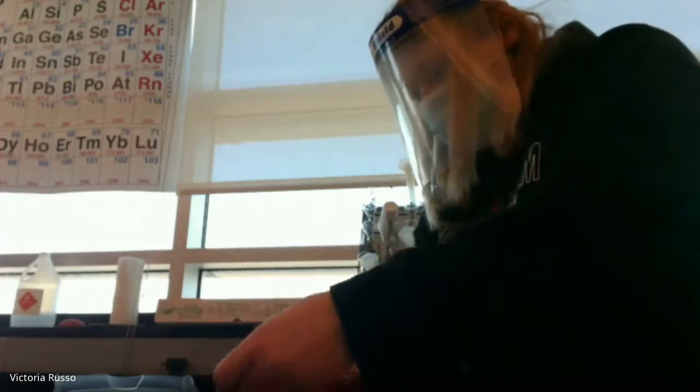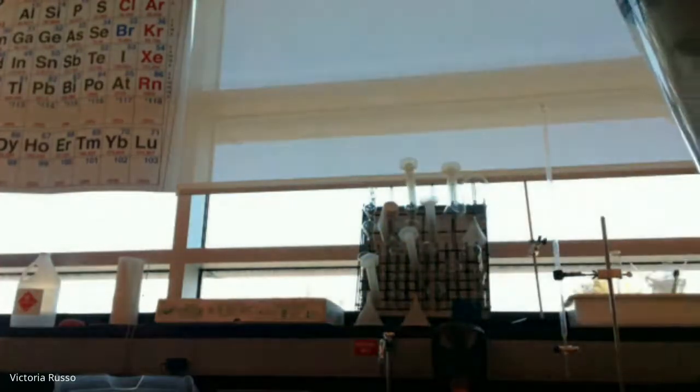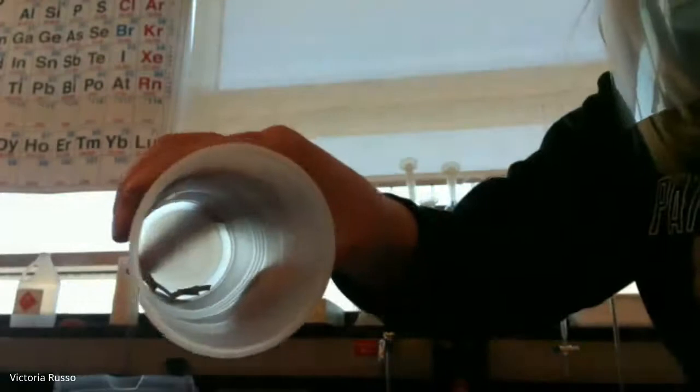And they're getting massed. All right, that's about a good amount, I would say. So the mass of metal that we're using is 0.168 grams. And you can see what it looks like. It's just sort of strips of metal. That's magnesium.